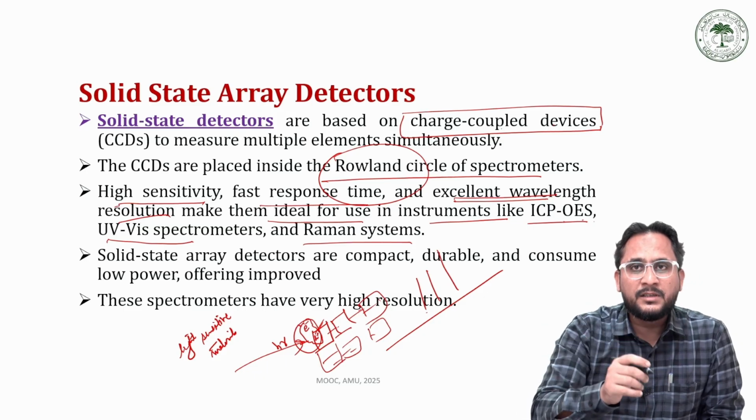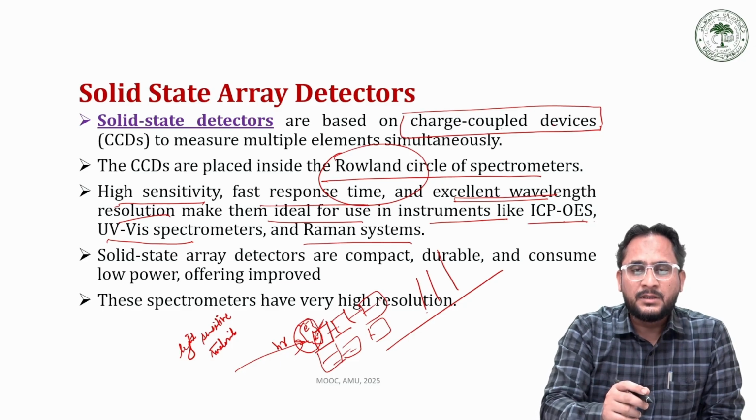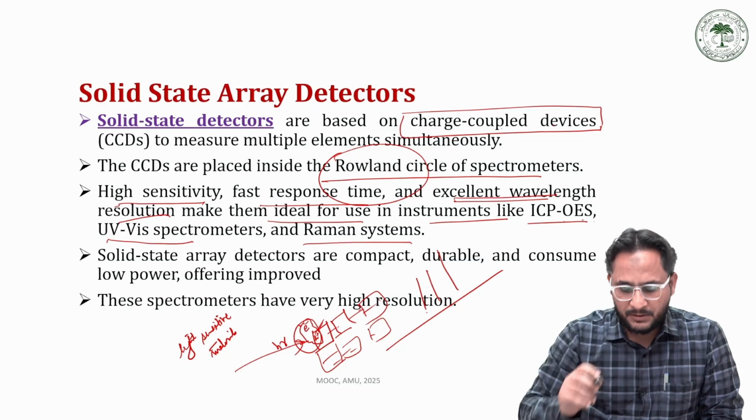So these solid state array detectors are always used with polychromators, and therefore they are part of simultaneous spectrometers.